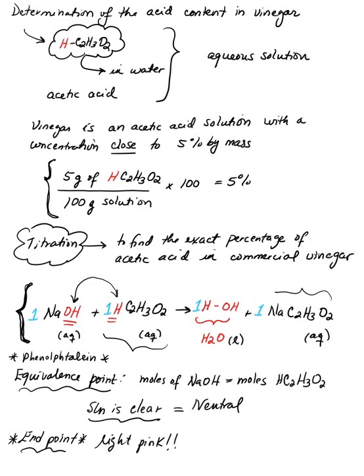From your titration, the end point is what you can observe, which is when the color changes. So we're aiming to get the light pink color again in this titration. So the number of moles of the base are very close or almost exactly the same as the number of moles of the acid present.